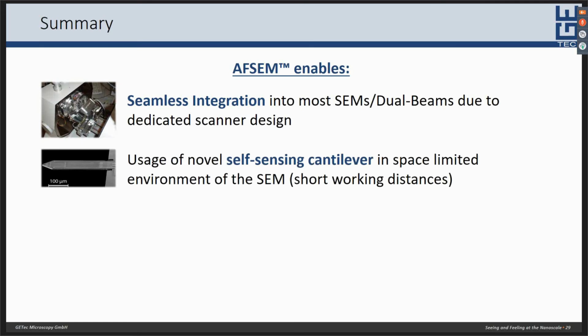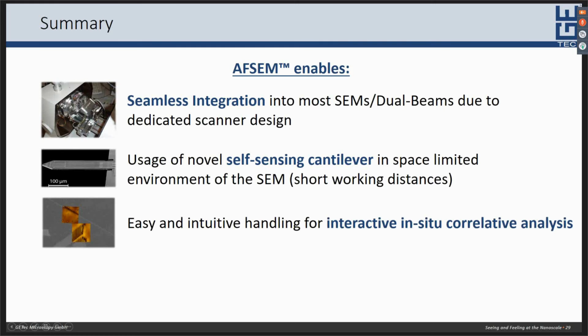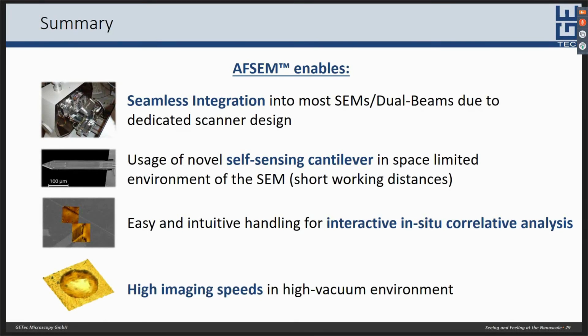And in addition, it also enables the usage of novel self-sensing cantilevers in space-limited environments of the SEM, optimized for short working distances and for combination with additional add-ons like tensile stages, gas injection systems, or nanoindenters. The AFSEM is a very easy and intuitive tool and even allows an unexperienced user to perform interactive in-situ correlative analysis. And it allows for high imaging speeds even in high vacuum environment.